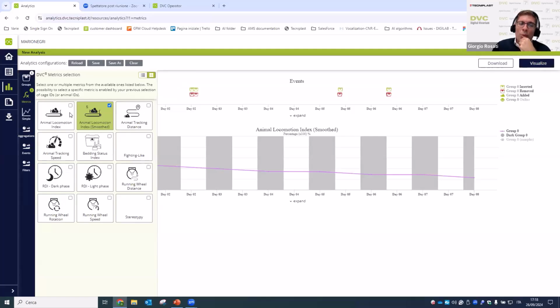But we would even like to disable this button in your interface. It stays in the background, but you cannot click on it because it will disappear. We would like to do it simply because the smoothed one is much more robust and stronger, and we don't want you to make a mistake by selecting the old one.